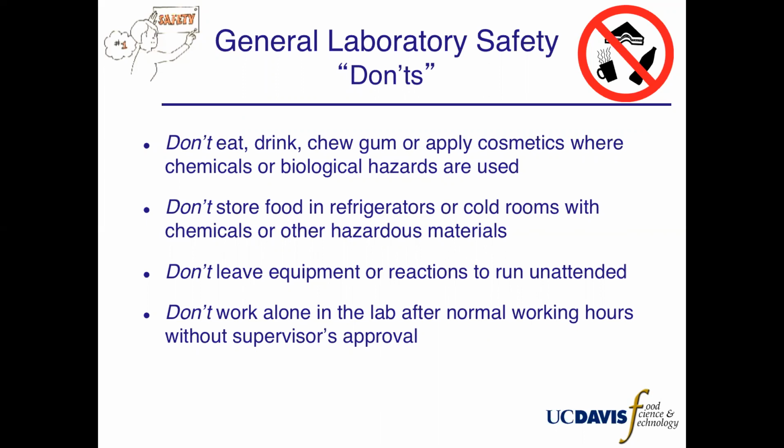Don't leave equipment or reactions running unattended. This could lead to unwanted accidents. Don't work alone in the lab after normal working hours without supervisor's approval. In the time of COVID, many people may find themselves working alone in the lab. However, you must discuss this with your PI. There may be some procedures where working alone poses a hazard and is therefore not allowed.